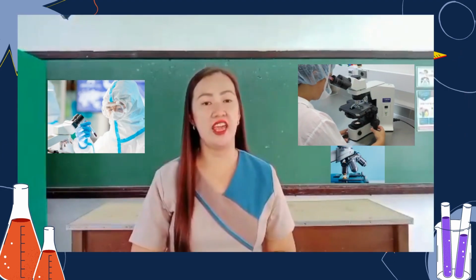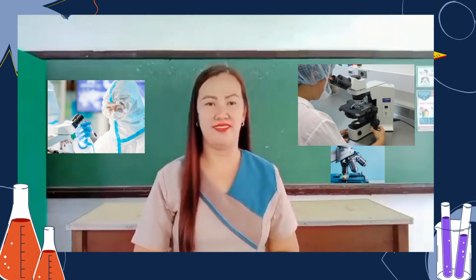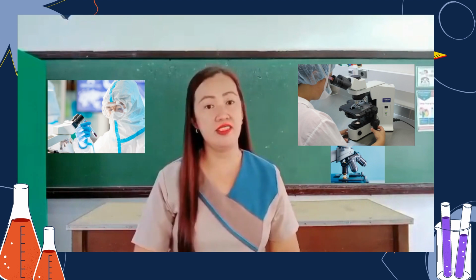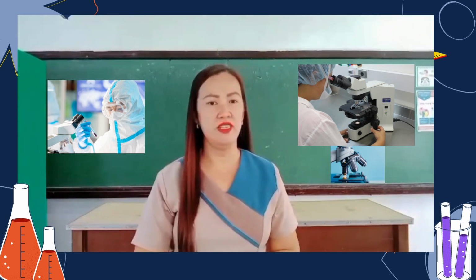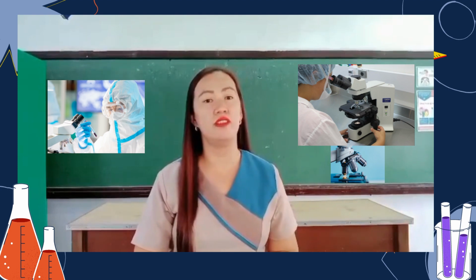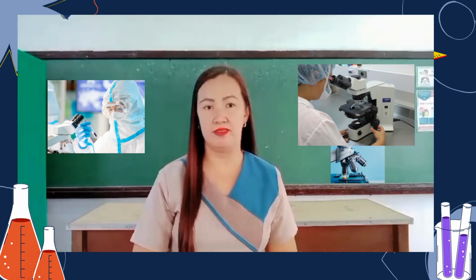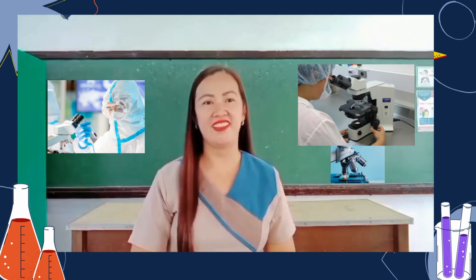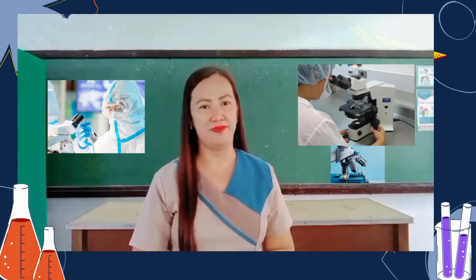How are the scientists able to come up with solutions to stop this outbreak? How can they see coronavirus and study it? What instrument do they use to study coronavirus and even other microorganisms that have caused death to millions of people? Yes, with the help of the instrument called the microscope.